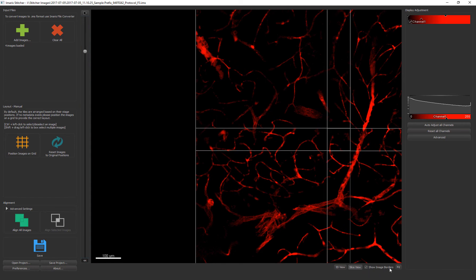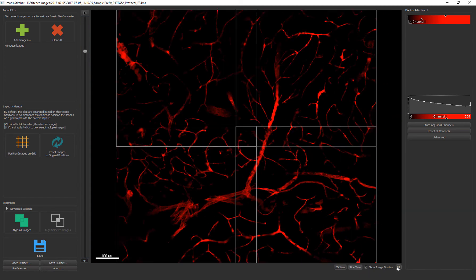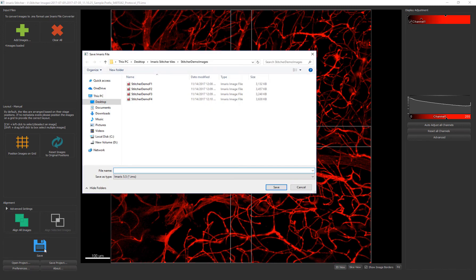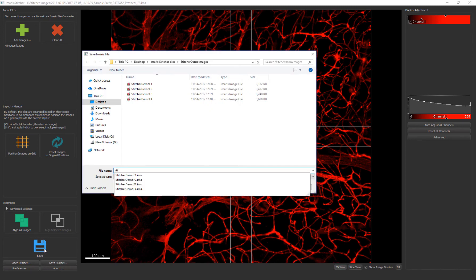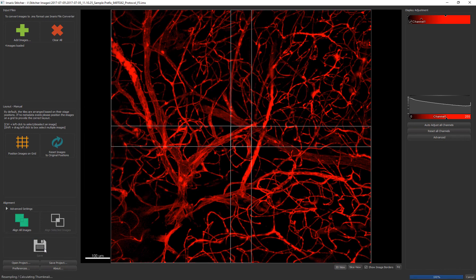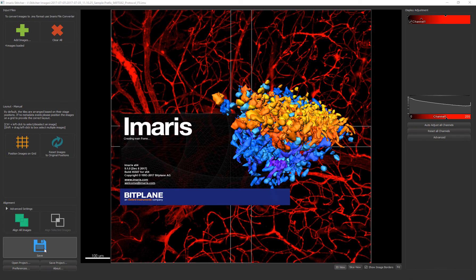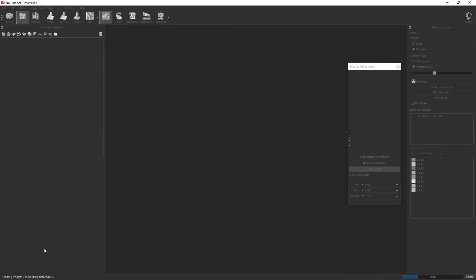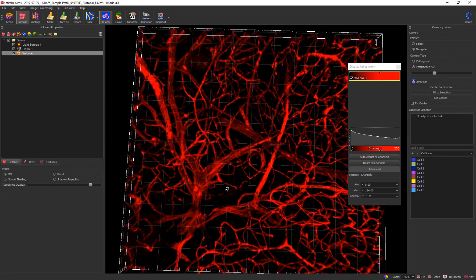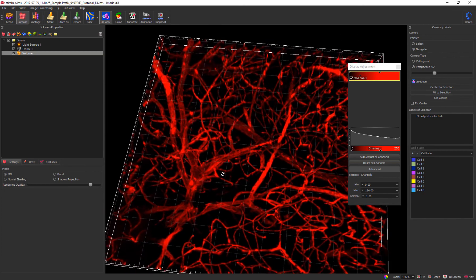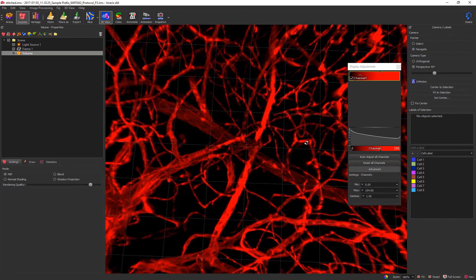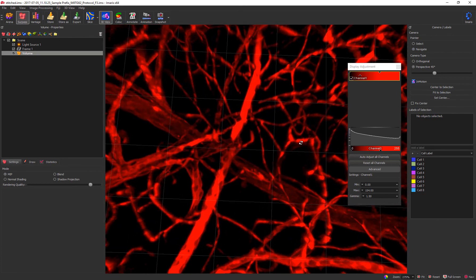And finally you can click the Save button to stitch the image tiles together and open the resulting file within Imaris. Once the file is saved Imaris will automatically open and your file is loaded. Now you can visualize and analyze your image using Imaris.